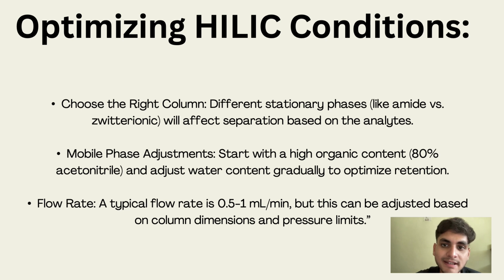Optimizing HILIC conditions. Choose the right column. Different stationary phases like amide versus zwitterionic will affect separation based on the analytes. According to our needs, we will choose the stationary phase.